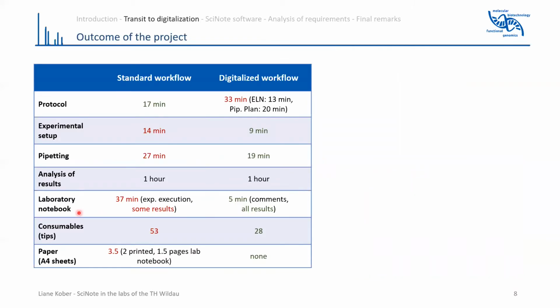And within this project, I also wanted to compare a bit what the standard workflow and the new workflow would mean for us for time saving and also sustainability. And when you look here at the red and green numbers, you will see that mostly the digitalized workflow is faster and has a lot of advantages.